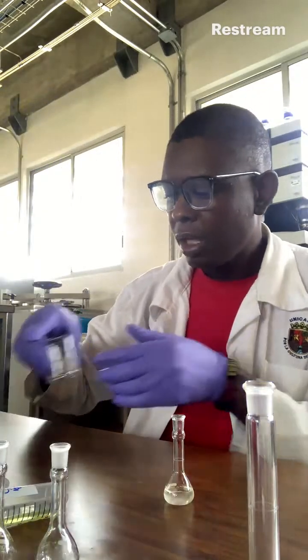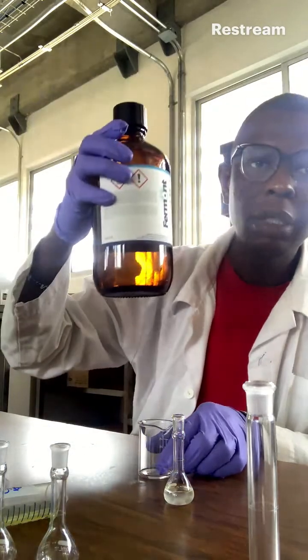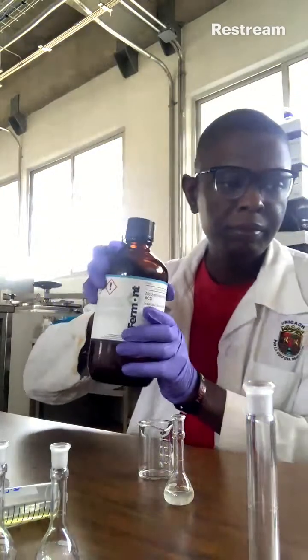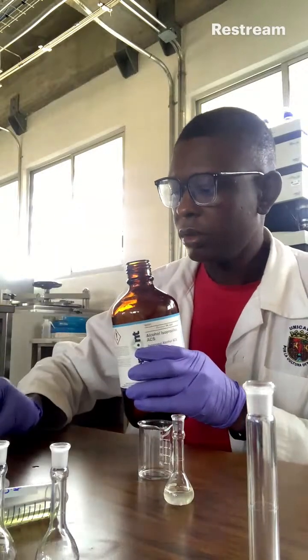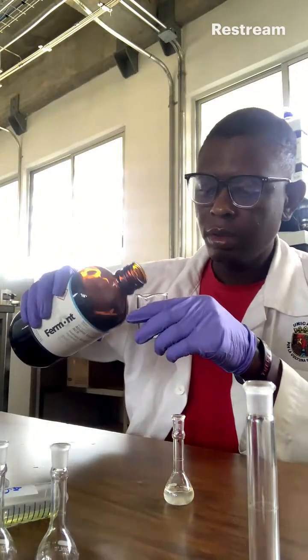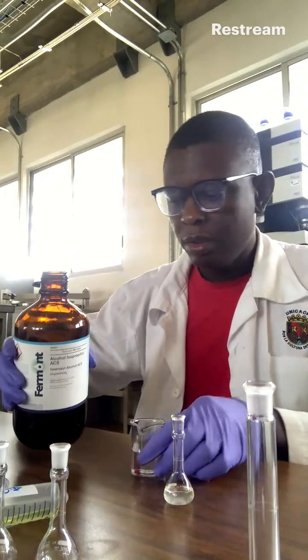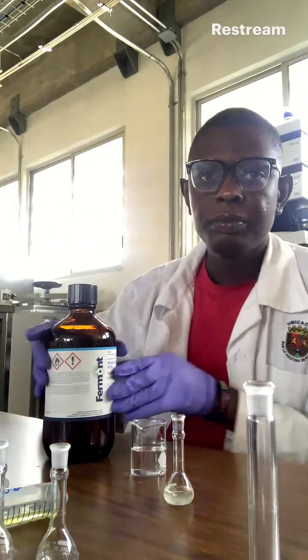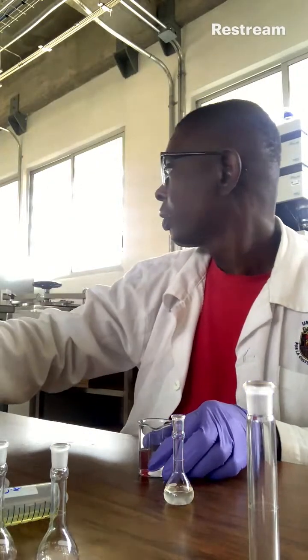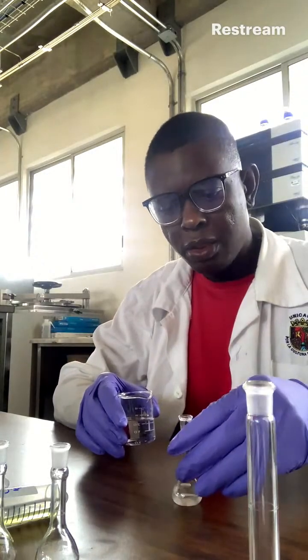Now I'll have to take isopropanol to dilute it. So this is my isopropanol. Now I'll be diluting it to the 10 ml level.